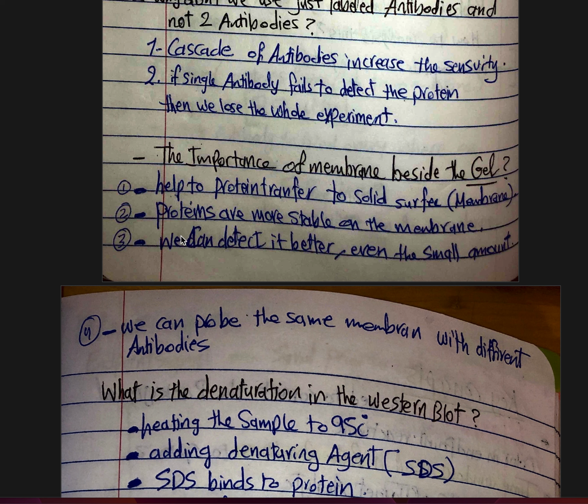Why can't we use only the gel? Because we need a solid surface to detect the protein, and it's important to transfer this protein to the solid surface, I mean here the membrane. The membrane is so useful for detecting even a small amount of the proteins, and the proteins are more stable in the membrane.